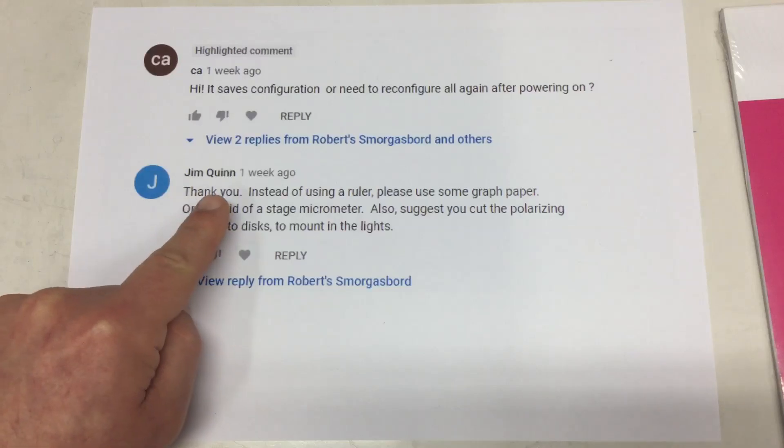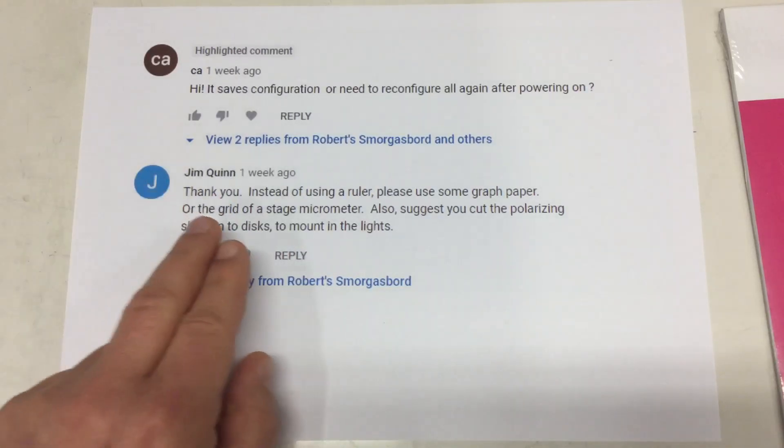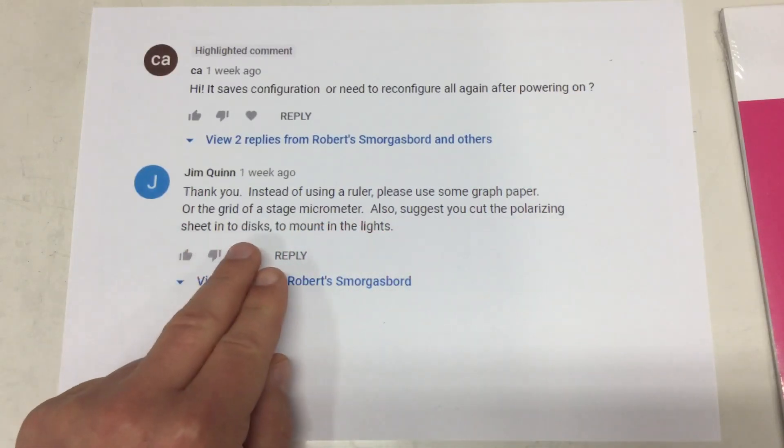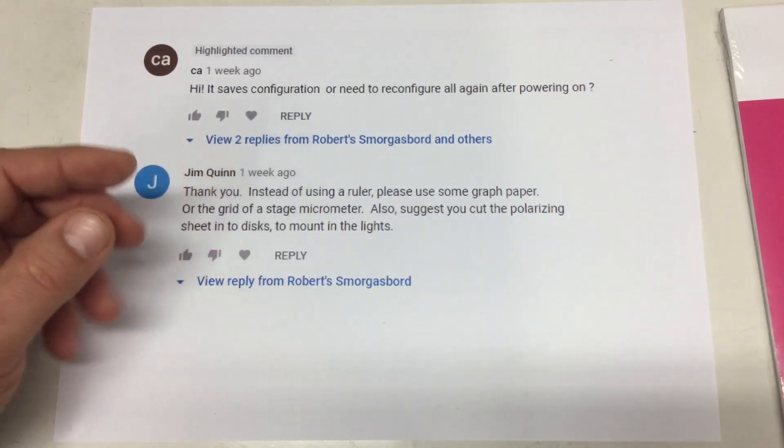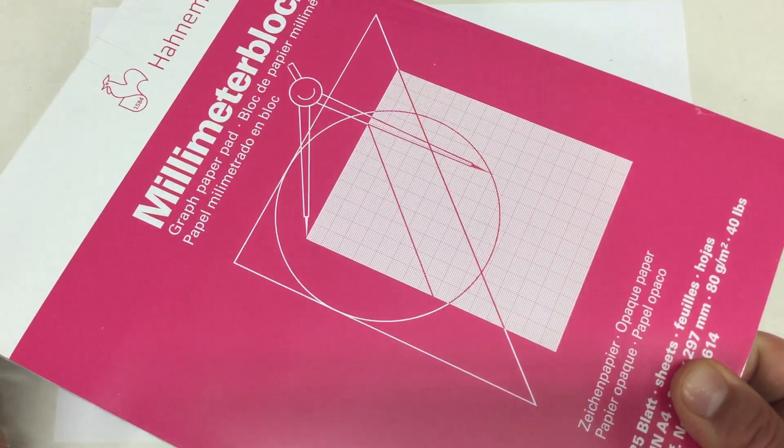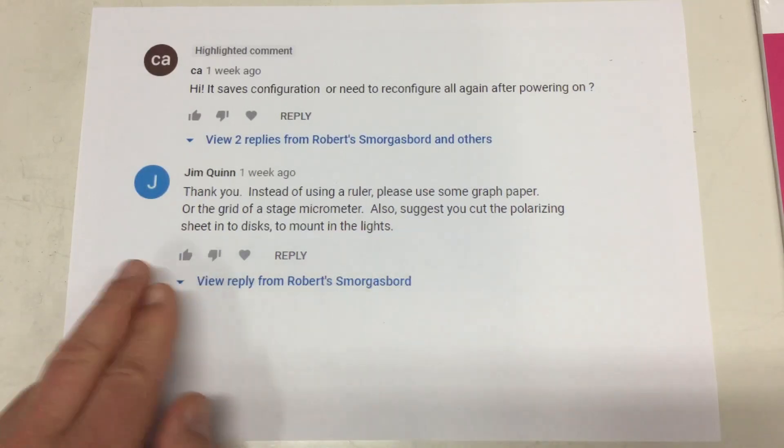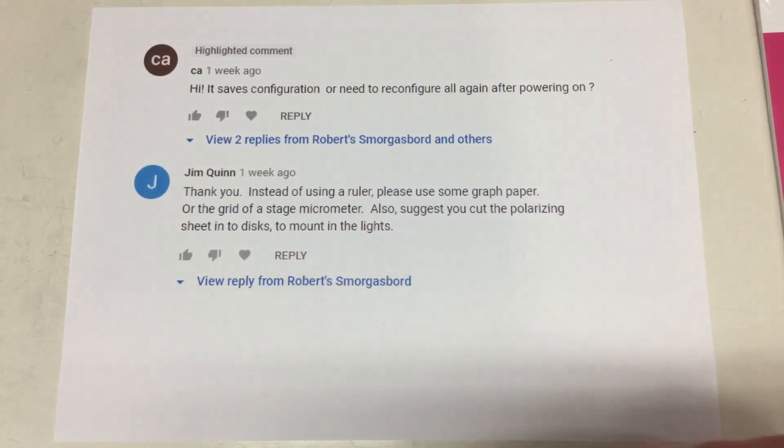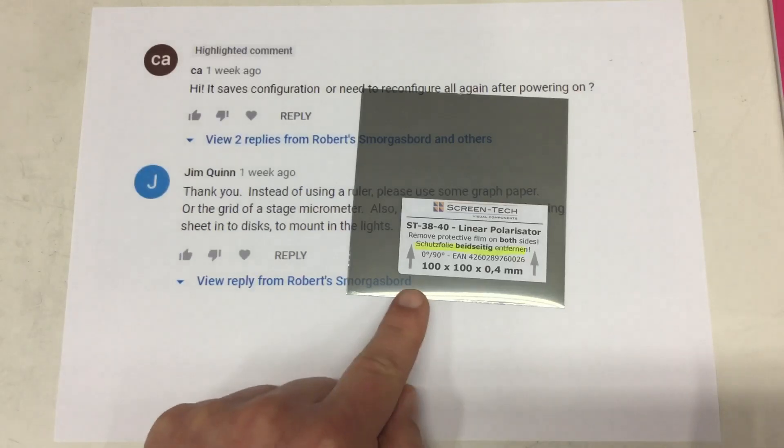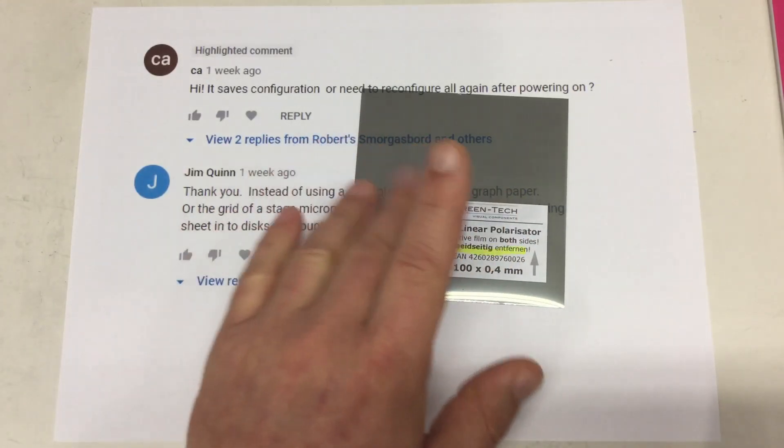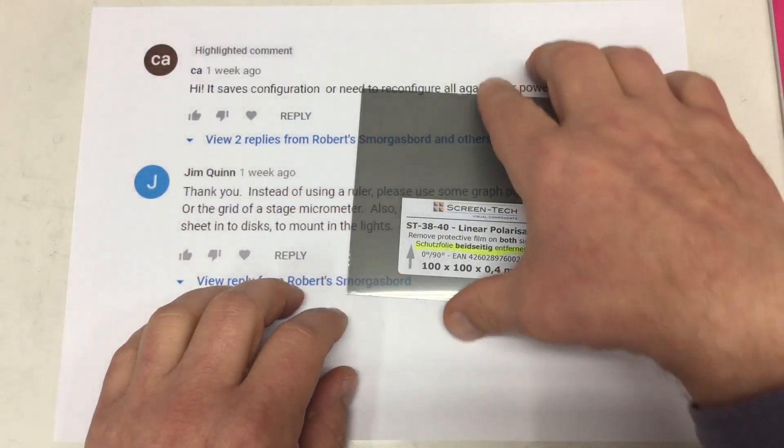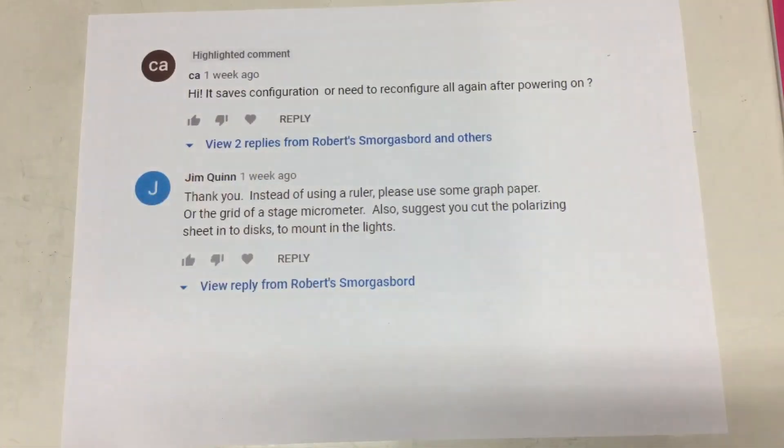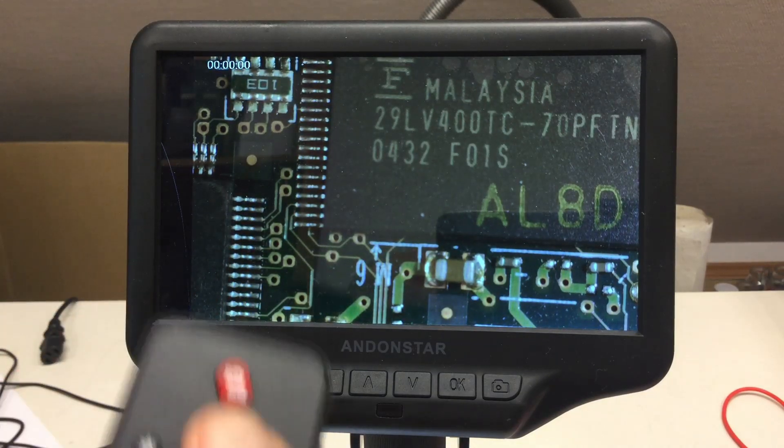And then Jim Quinn asked, instead of using a ruler, please use some graph paper or a stage micrometer. I don't have a micrometer, but I bought some graph paper, we will use that. Also, suggest you cut the polarizing sheet into discs to mount in the lights. Indeed, I got some linear polarization film for that purpose. This will require some experimenting and will take a little bit longer. So let's start with the configuration stuff. I won't do that for all settings, but let's go.